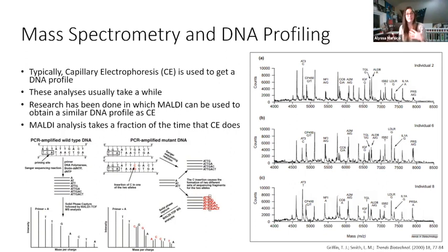So not only is Mass Spec useful in the field of forensic chemistry, it's also crossing over into the field of biology. And actually, my new grad student is working on a project that an old grad student worked on that I got a paper published about, which is using GC Mass Spec to analyze hair samples. Usually you can't get a nucleic acid DNA or nuclear DNA sample from hair, right? Unless you have that follicular tag attached.